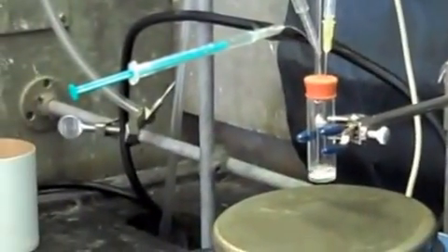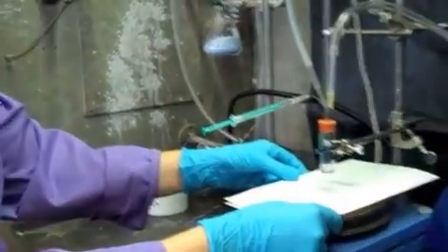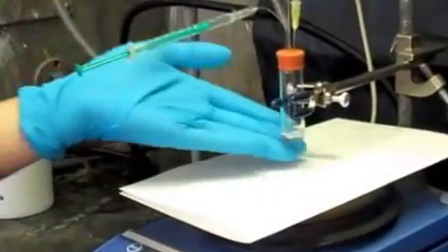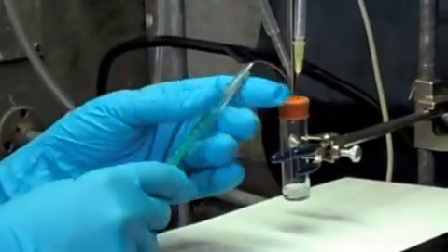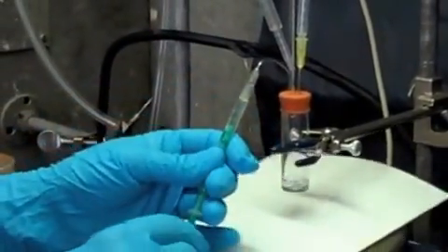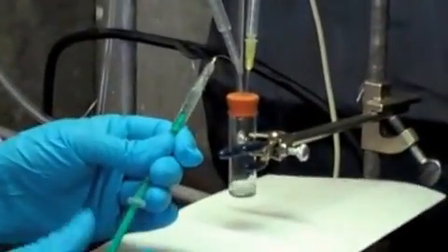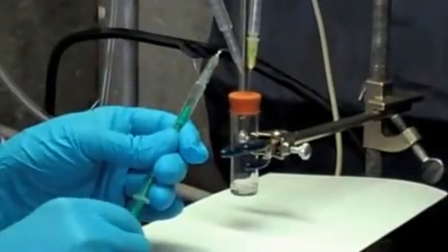I'm just about ready to perform my BuLi titration, and since we're looking for a yellow endpoint, I'm going to place a white sheet of paper below my vial so that I can see the color change easily. I need to get all of the nitrogen out of the end of my needle, so I'm going to draw back again, bend my needle, and slowly twist the barrel of the 1 ml syringe, carefully watching the bubble disappear.